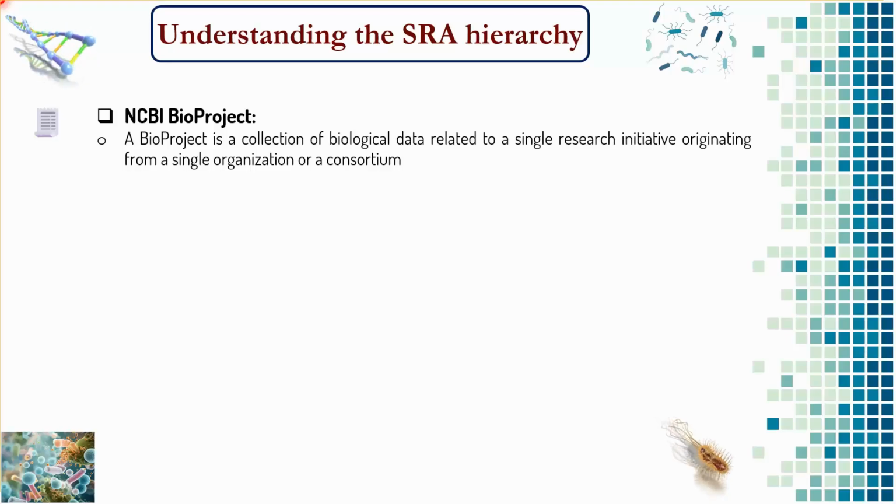First is NCBI BioProject. A BioProject is a collection of biological data related to a single research initiative originating from a single organization or a consortium. It provides users a single place where all data generated from a particular study are organized and linked together.